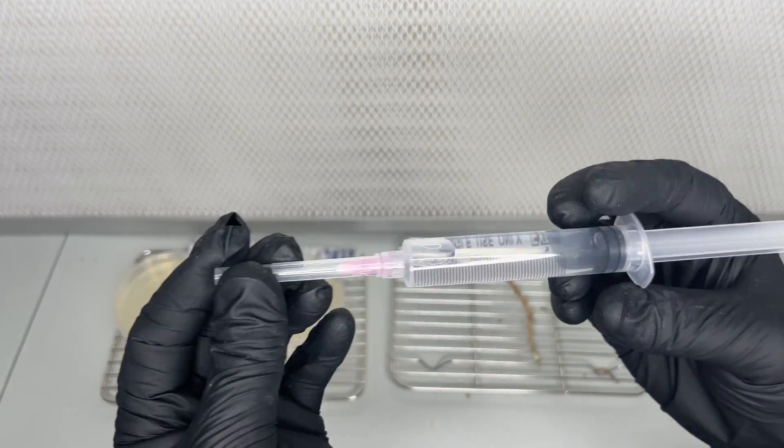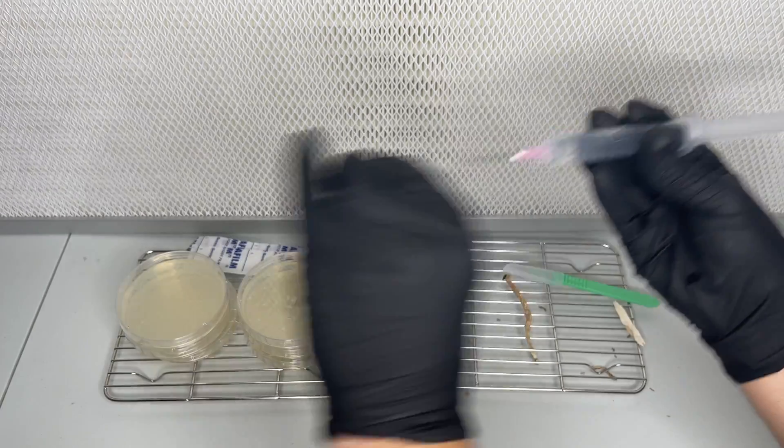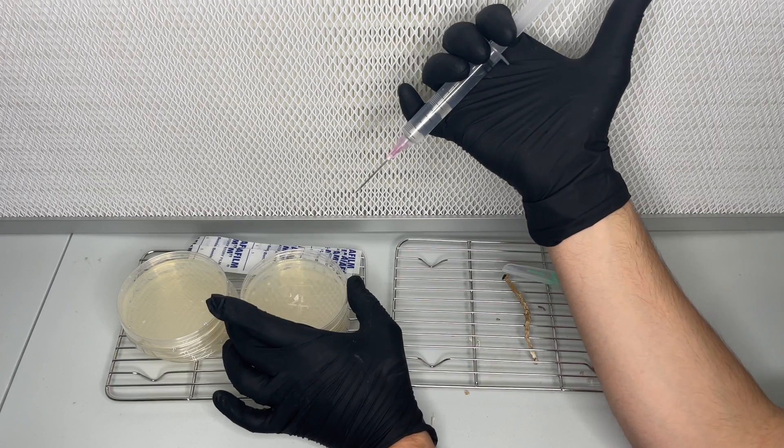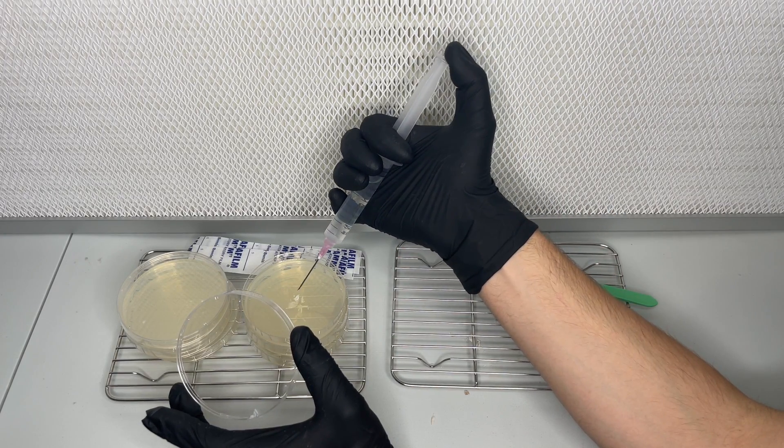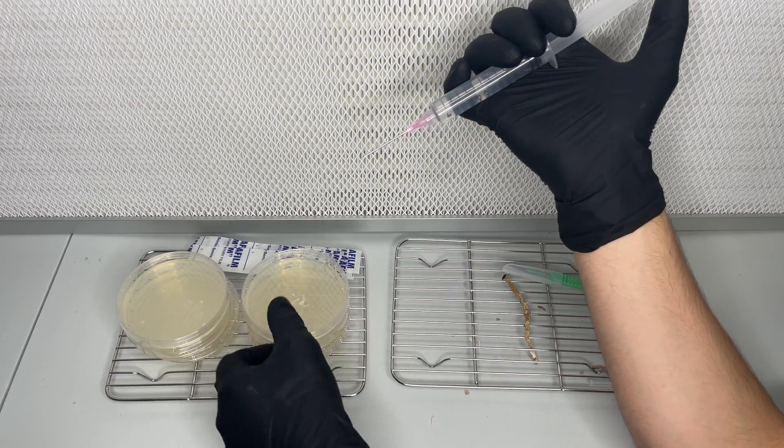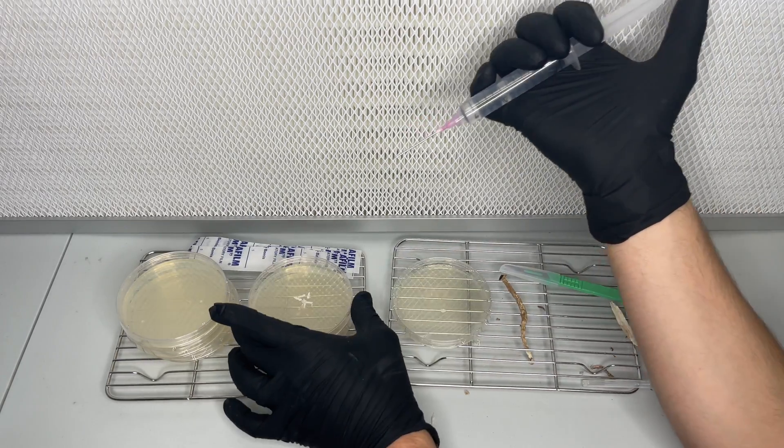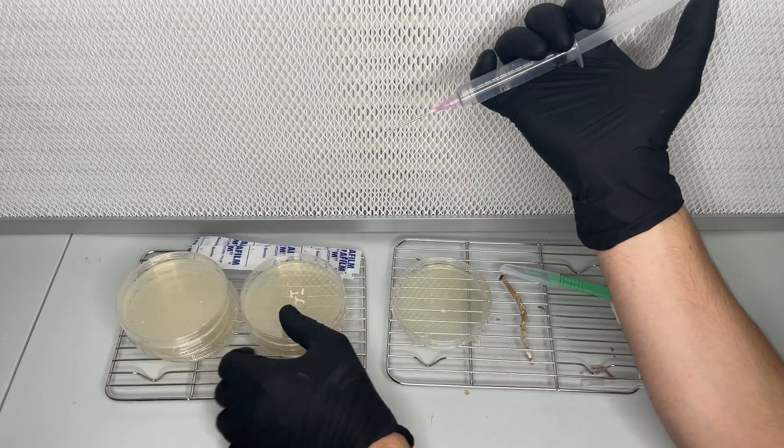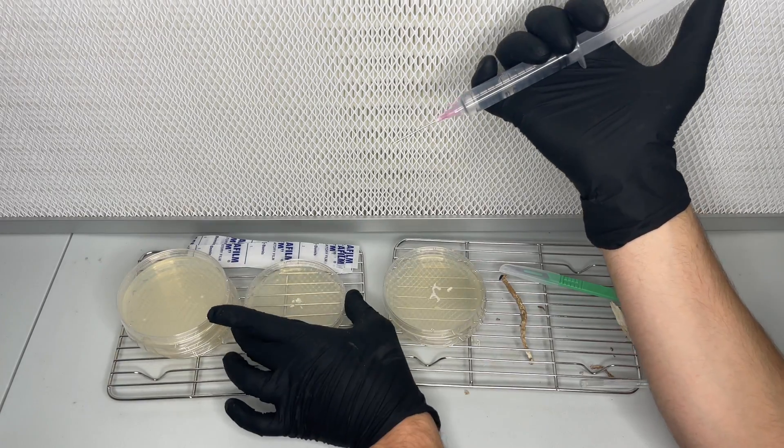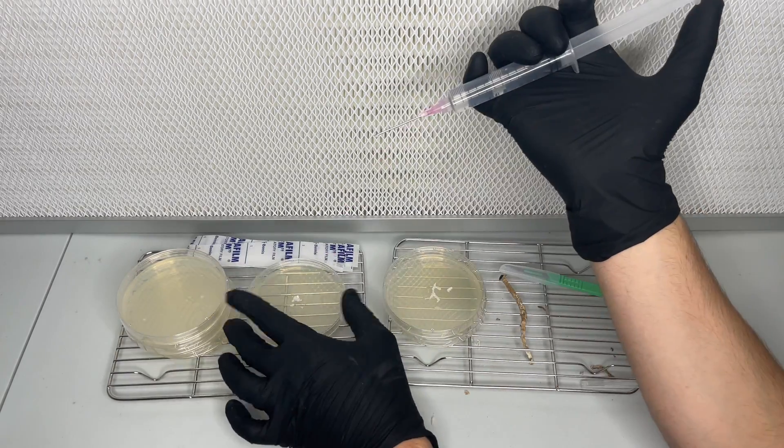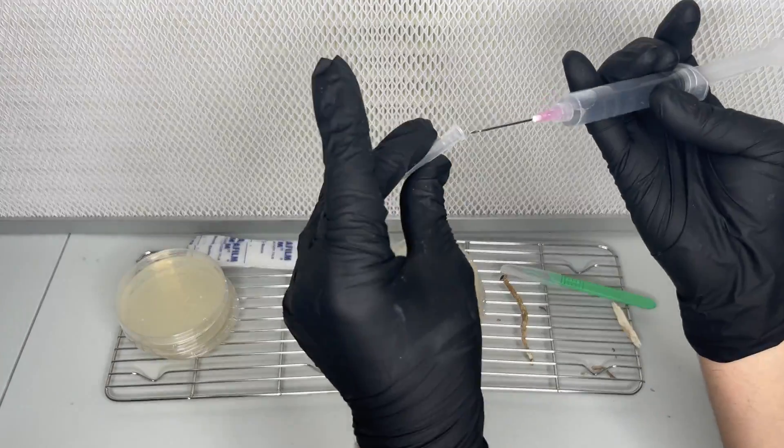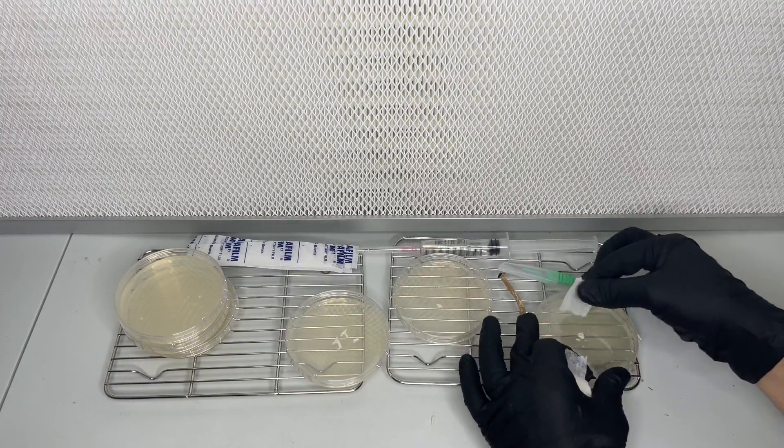After I transferred the tissue to the three agar plates I used some sterile water that I made by boiling water and then sucking it up into the syringe and allowing it to cool down. I added a few drops of sterile water to each agar plate to rehydrate the dried tissue.